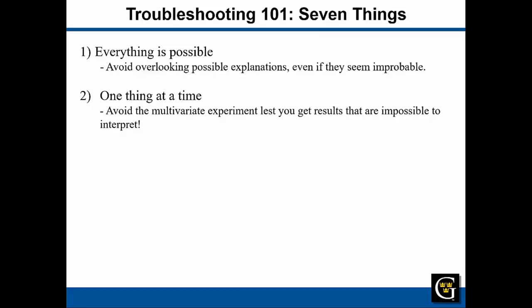So even though it feels maybe inefficient at times to work very methodically through a problem, I think it's generally speaking wise to just change one thing at a time so that we have a clear way to interpret the results of our changes.